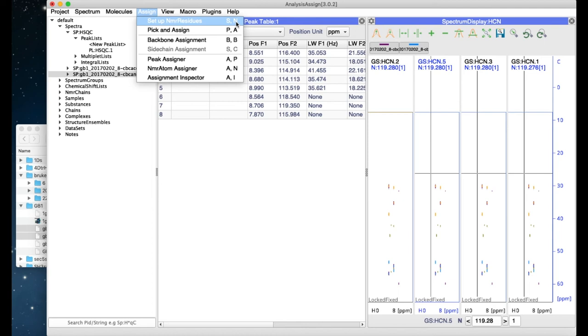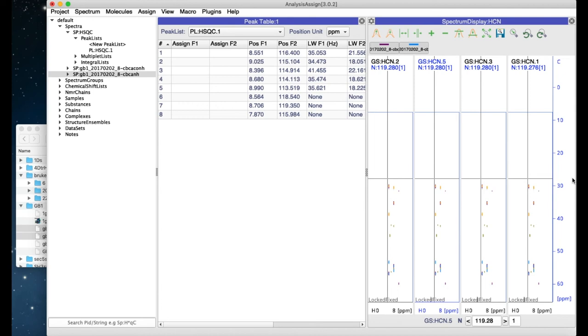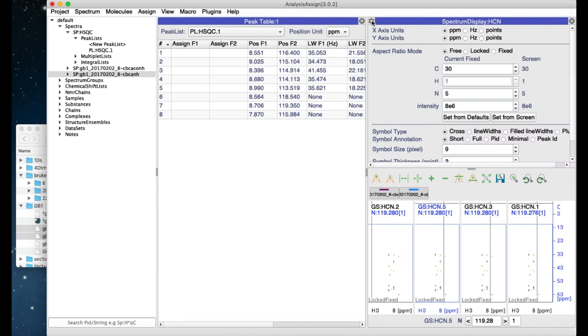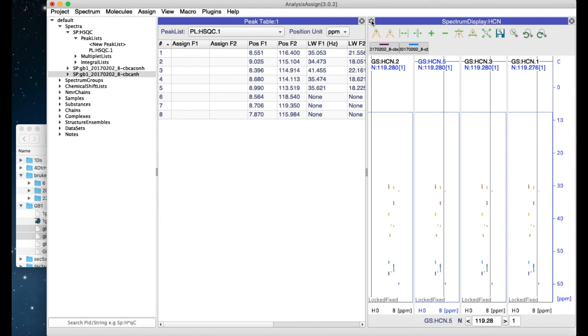You will see that some modules have a little gear icon in the top left-hand corner. If you click on this, this will bring up a settings panel. Click on it again to close the settings panel again.